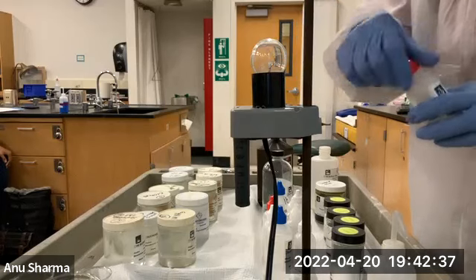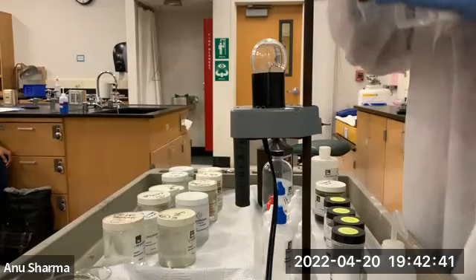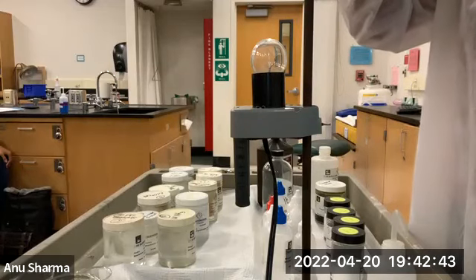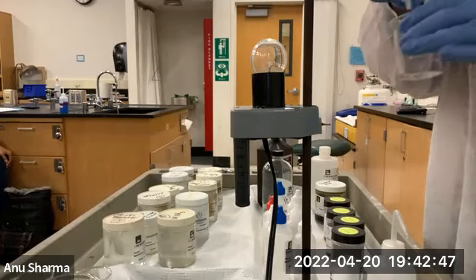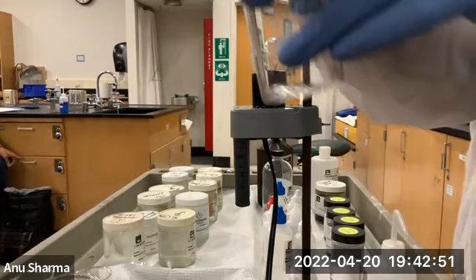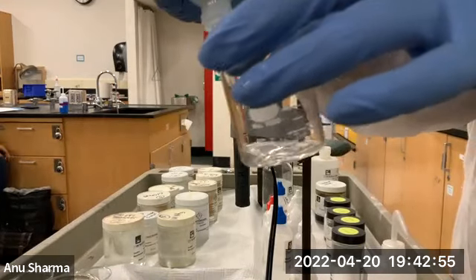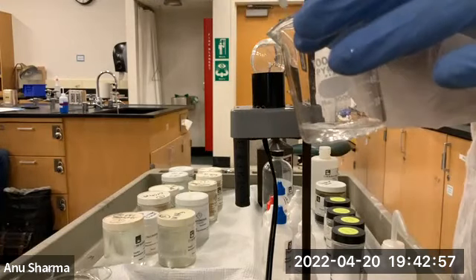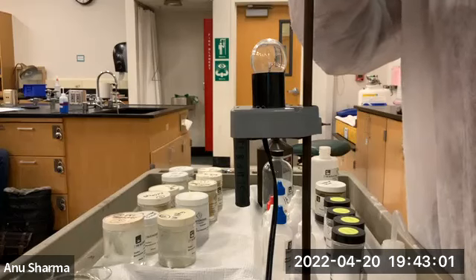I don't know if you guys like nail polishes, but if you want to remove nail polish, they use acetone, so I'm trying to bring acetone into this. It's a nice clear solution. Like it's not even a solution, it is acetone. It's clean and clear.